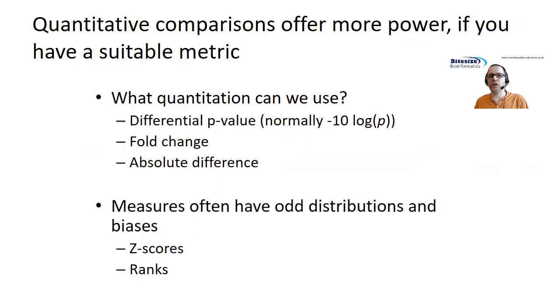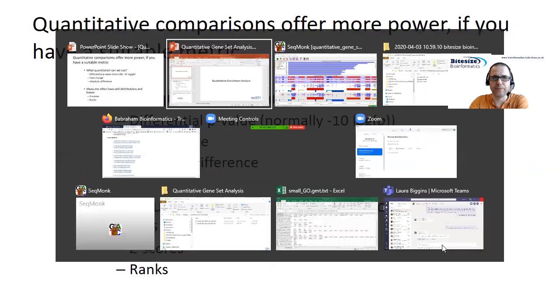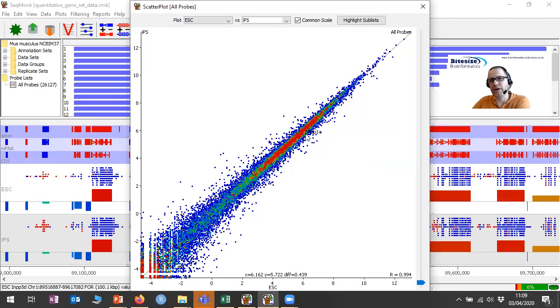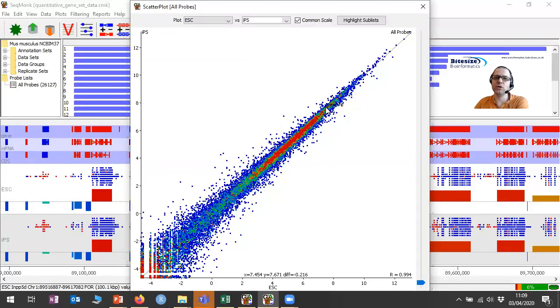In this dataset, we're going to use a simpler metric: just the difference in expression between the two gene sets — so how far we fall from the diagonal on the scatter plot. It's effectively like a fold change or an absolute difference. But a problem is that those sets of differences have skews and biases. If I have a highly expressed gene, my differences are relatively small — they sit quite close to the line. If I have a lowly expressed gene, my differences are going to be very big. So I'm going to get biases because all the lowly expressed stuff will have big changes and all the highly expressed stuff will have small changes on average.